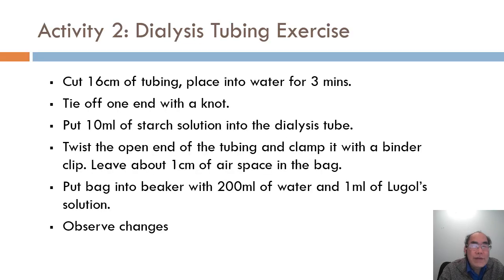Okay, so activity 2 is observing diffusion through a permeable membrane using dialysis tubing.